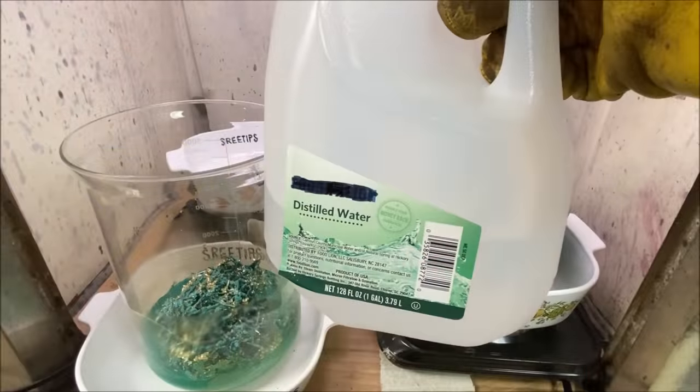This is going to be a waste solution in this beaker right here, copper only. Now we're going to put this back up on the heat in the back here.